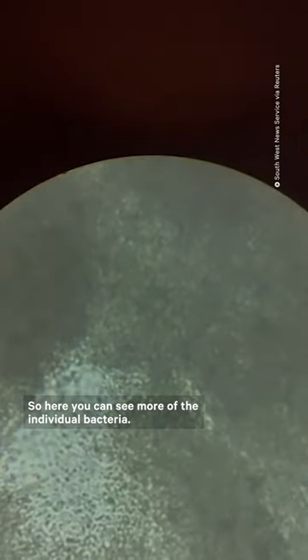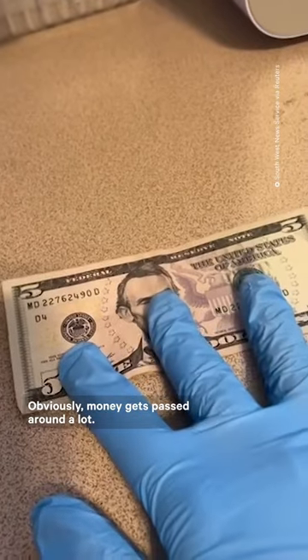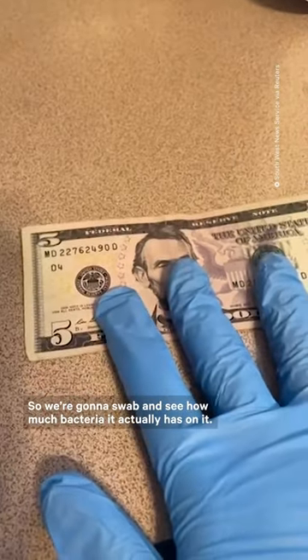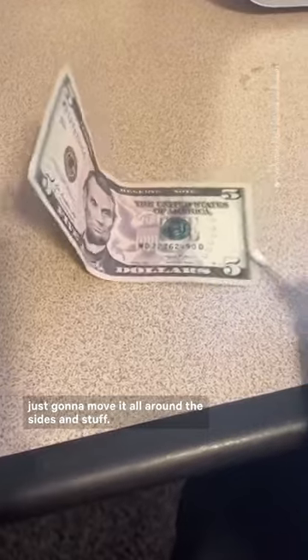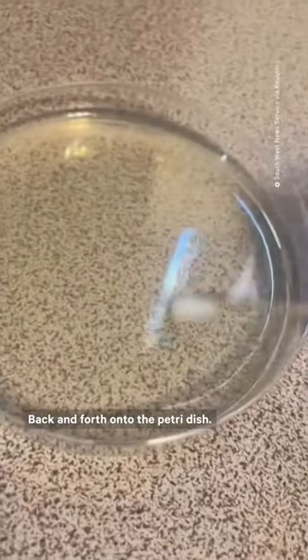So here you can see more of the individual bacteria. Obviously money gets passed around a lot, so we're going to swab it and see how much bacteria it actually has on it. Just going to move the swab all around the sides and stuff, then get it back and forth onto the petri dish.